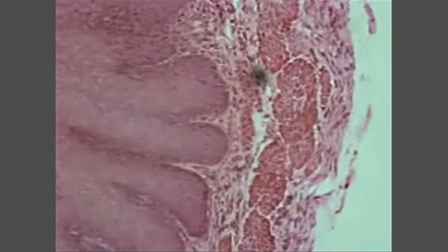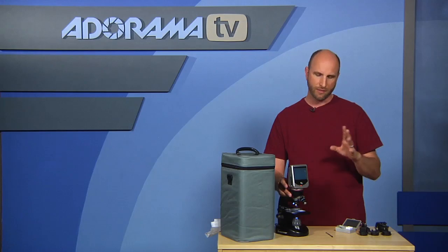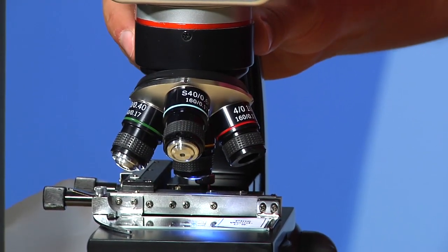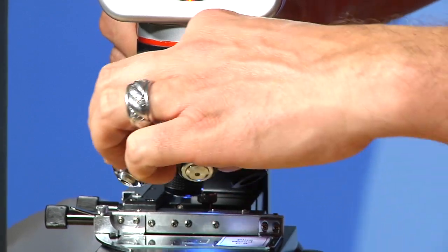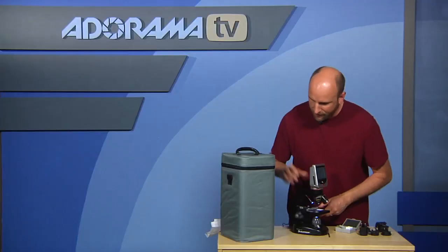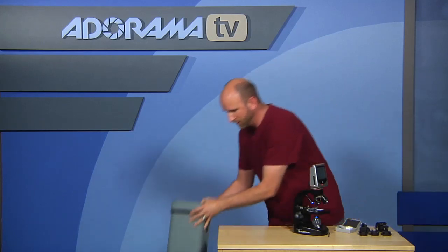Let me walk you through the different features of this microscope. It has a quadruple nosepiece, so on the front there are actually four lenses: a 4x, a 10x, a 20x, and a 40x. There's also a 4x digital zoom, but the optical zooms work just fine. Basically, you choose which magnification stage you want and go from there. The whole thing fits in this really nice, rugged case with a handle.